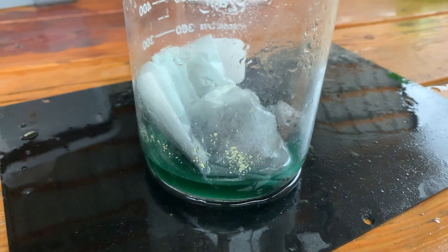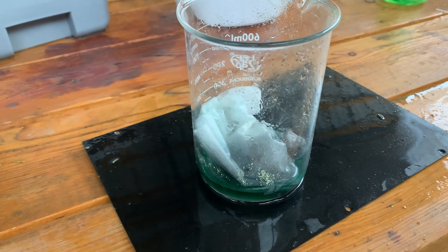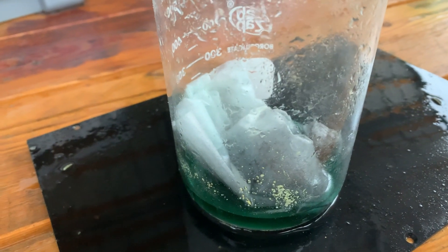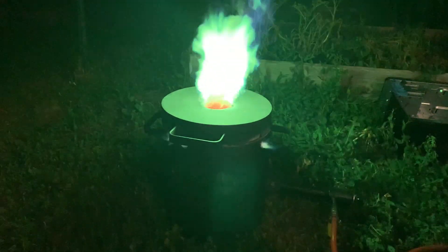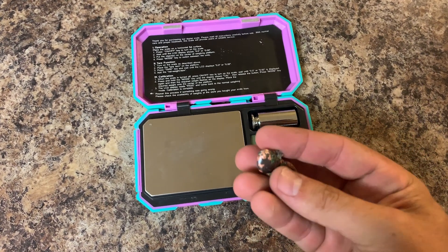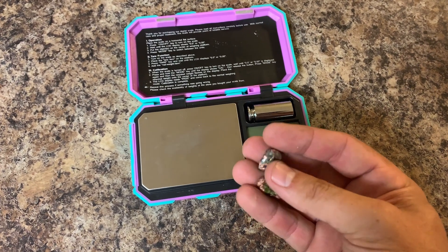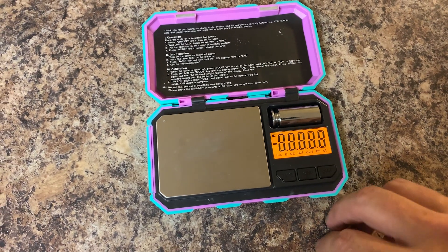There's all of the gold powder. I don't have a weight on it and the rain is still going, so my forge that I melt things down with isn't going to run today. If the rain stops with enough time tonight, maybe I can. This is what we ended up with — it's got a little bit of borax still on it, it's really dirty, and if you look real close you can see there's a copper tint to it. This needs to be refined again.